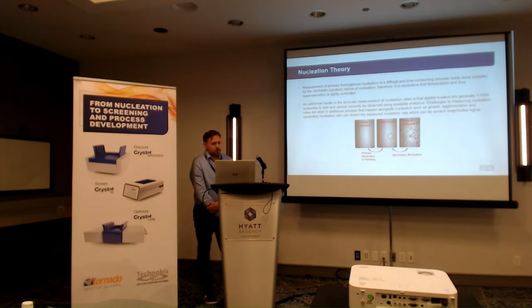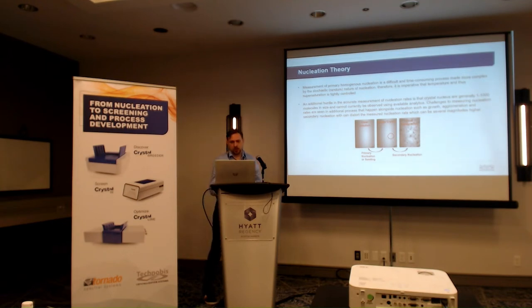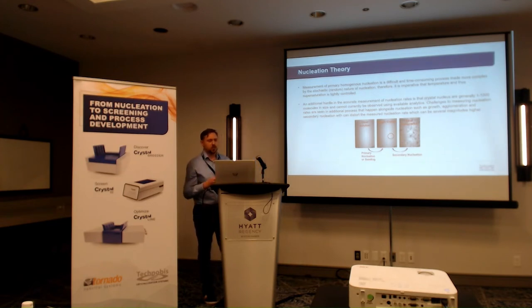Measurement of primary nucleation is actually quite difficult, because nucleation is stochastic, it's random. It can happen anywhere between a fixed time once supersaturation is generated to, depending on the system, several weeks. So you also need to very tightly control temperature, because this is closely related to your supersaturation.